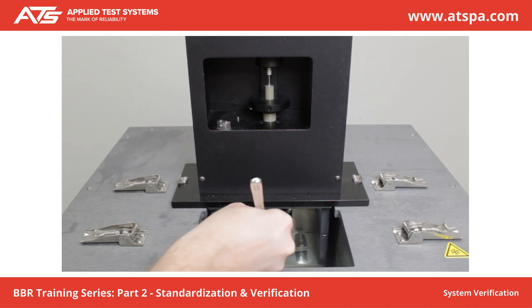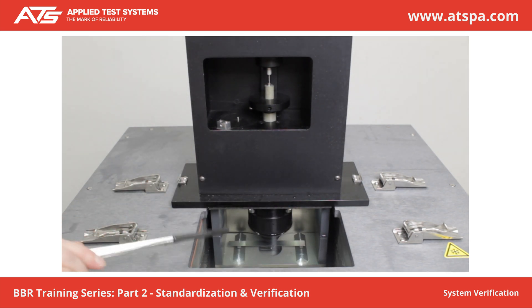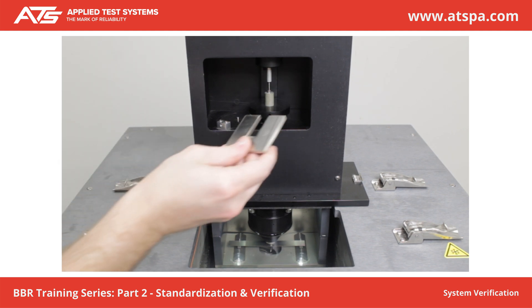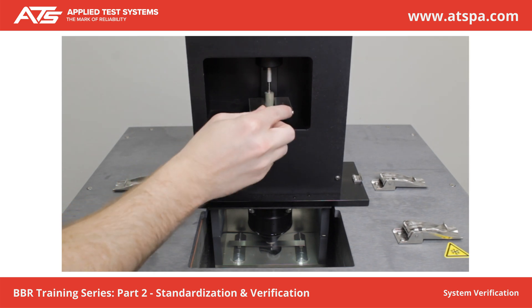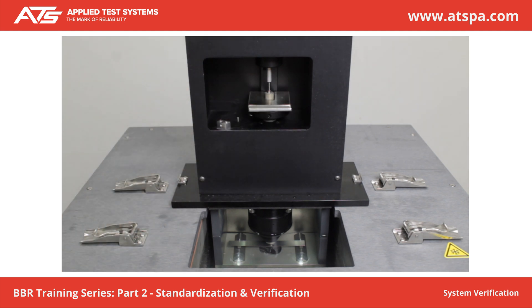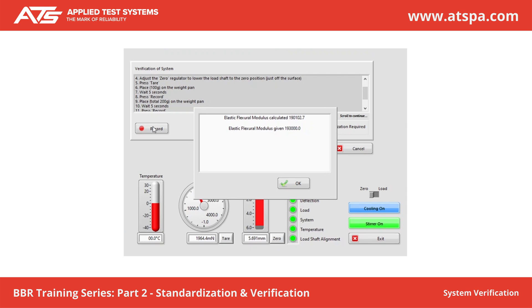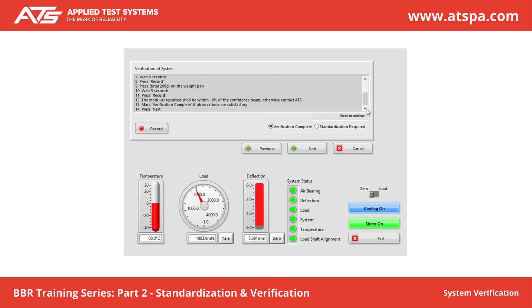Place the confidence beam on the sample supports. Adjust the zero regulator to lower the load shaft to the zero position. Press Tear. Place 100 g on the weight pan. Wait 5 seconds. Press Record. The modulus reported shall be within 10% of the confidence beam value; otherwise, contact ATS. Mark Verification Complete if observations are satisfactory. Press Next.